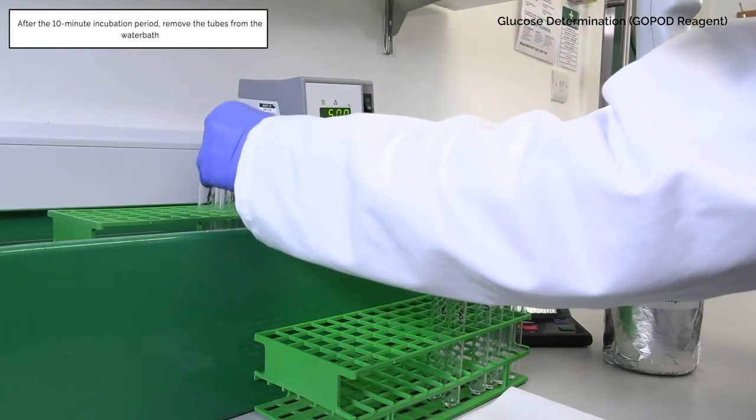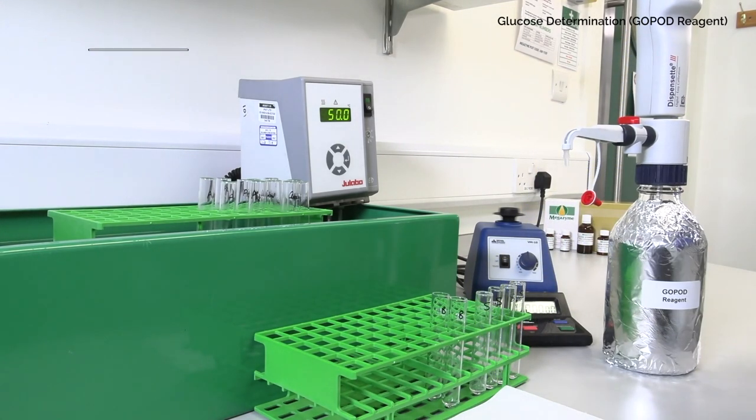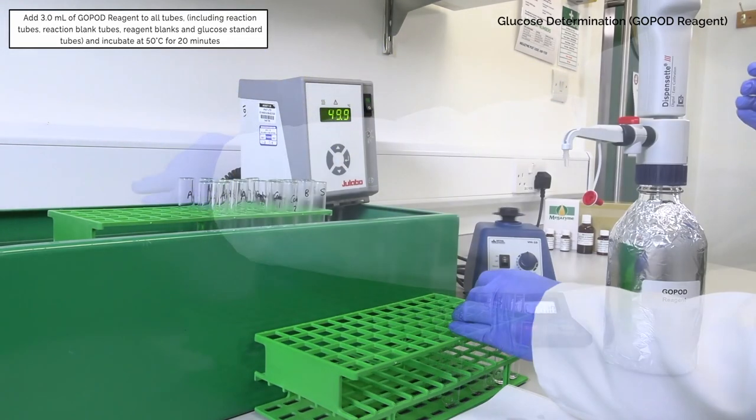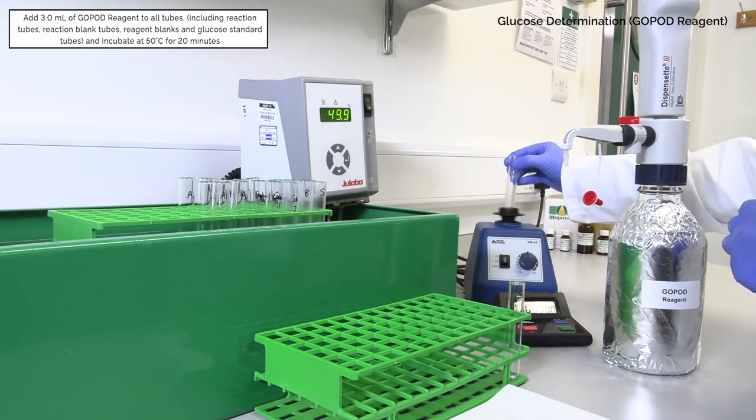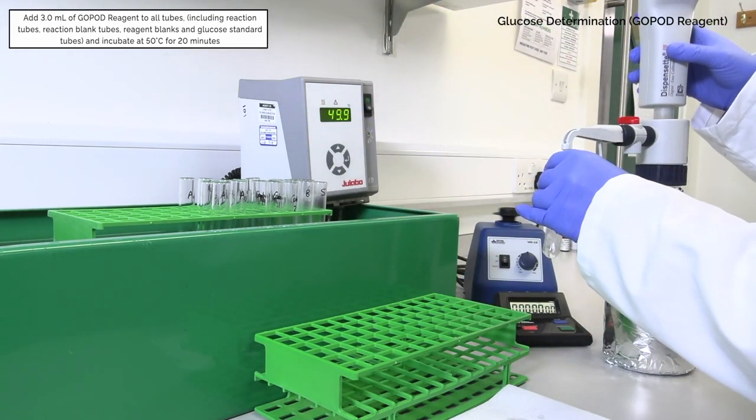After the 10-minute incubation period, remove the tubes from the water bath and add 3 milliliters of GOPOD reagent to all tubes, including reaction tubes, reaction blank tubes, reagent blanks and glucose standard tubes, and incubate at 50 degrees Celsius for 20 minutes.